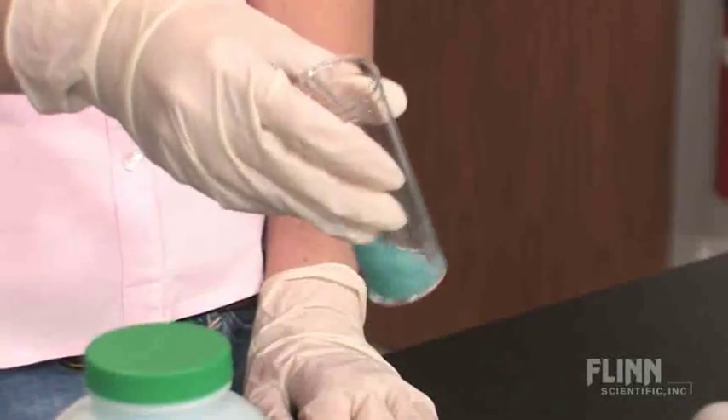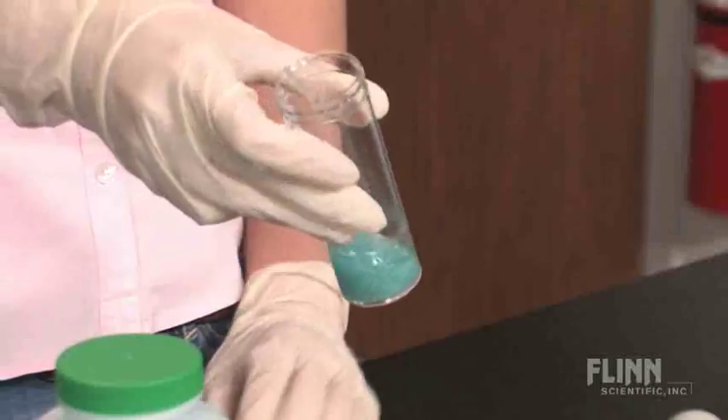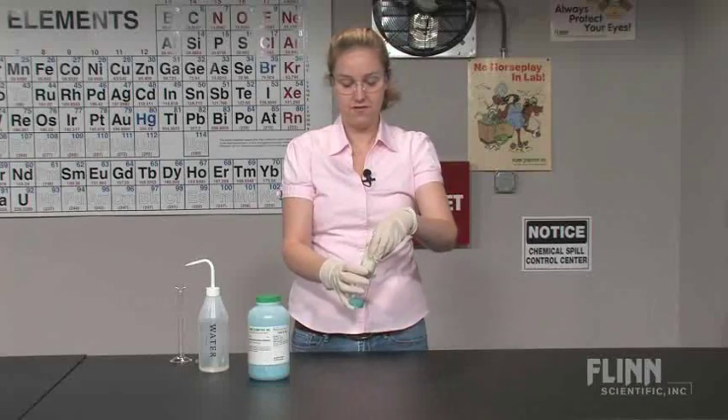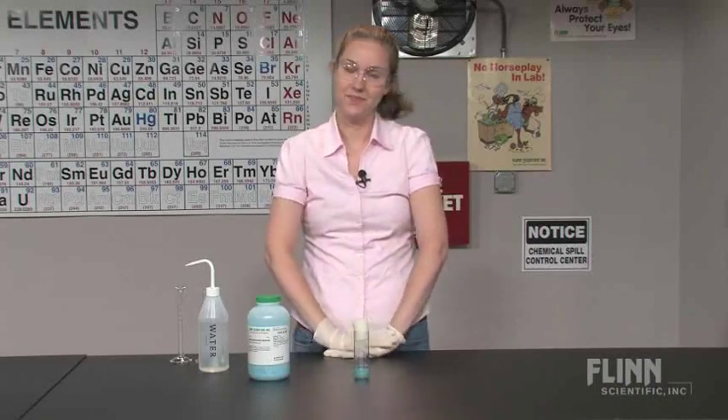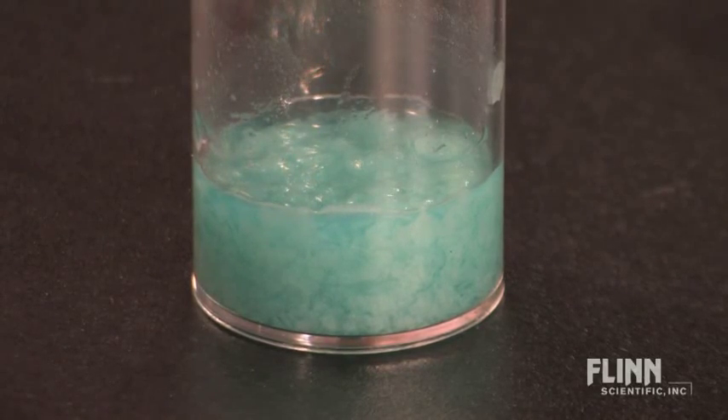Gently swirl the culture vial so the media can absorb the water, forming a gel. Allow to sit for a few minutes so it can solidify. With the properly prepared media, a healthy next generation of drosophila will emerge.